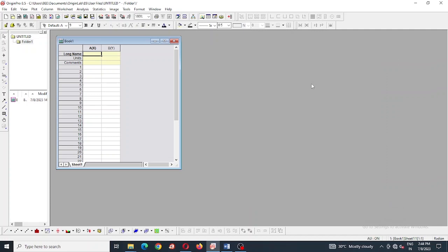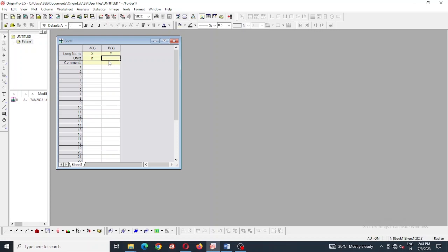We are using modified Gompertz equation in Origin 8.5 version. We are taking long name as X and Y, here X means it's for X axis and Y means it's for Y axis.